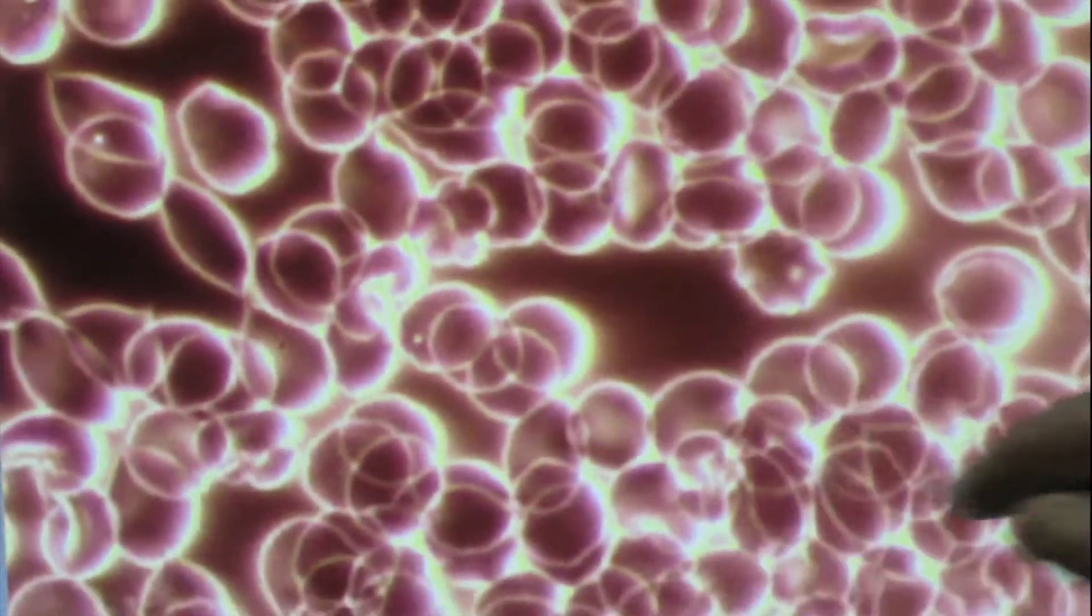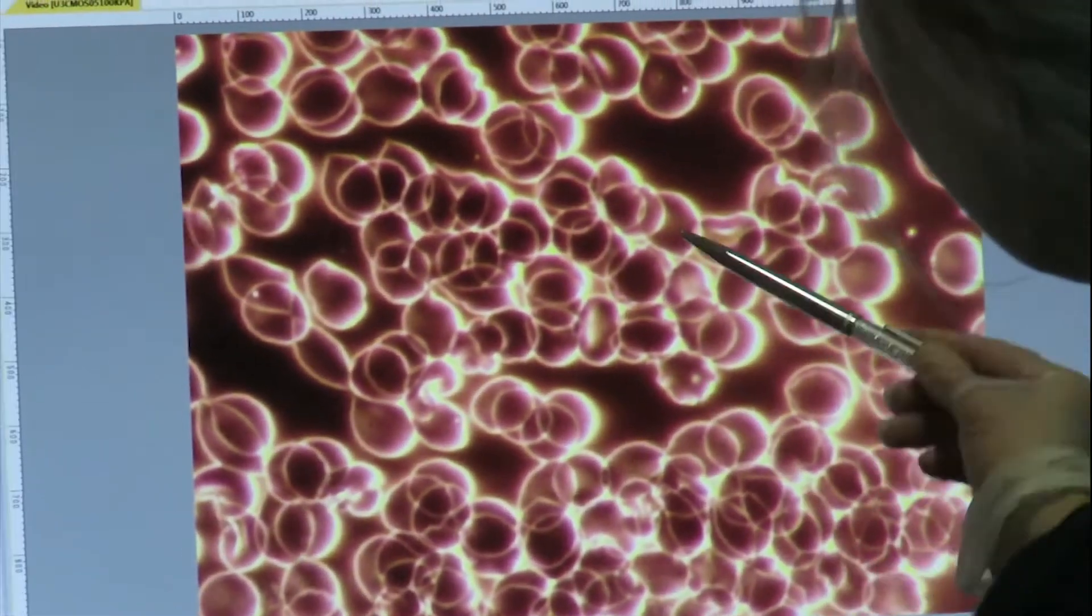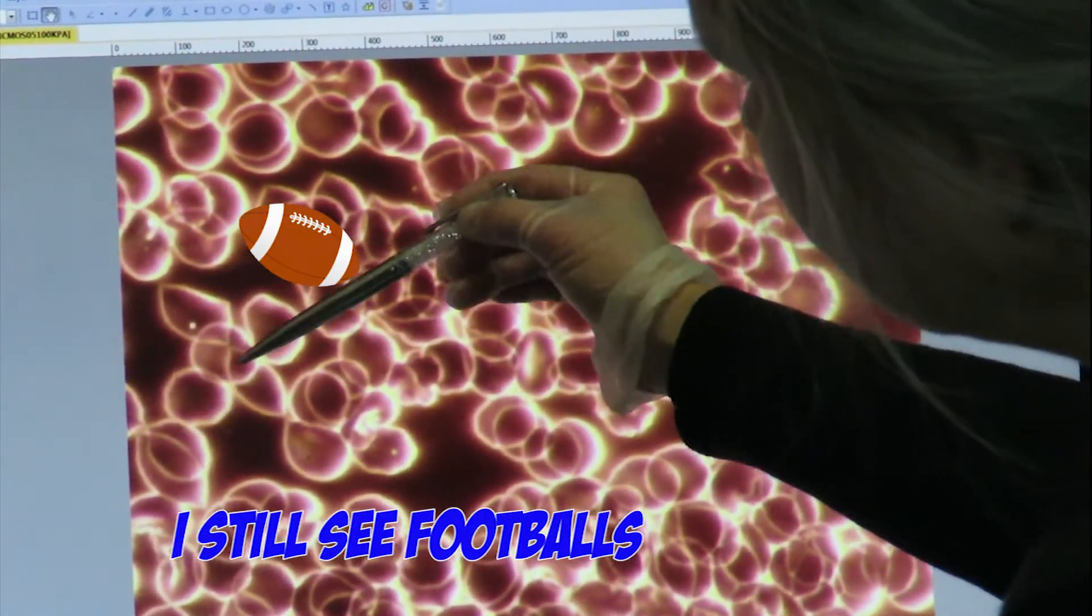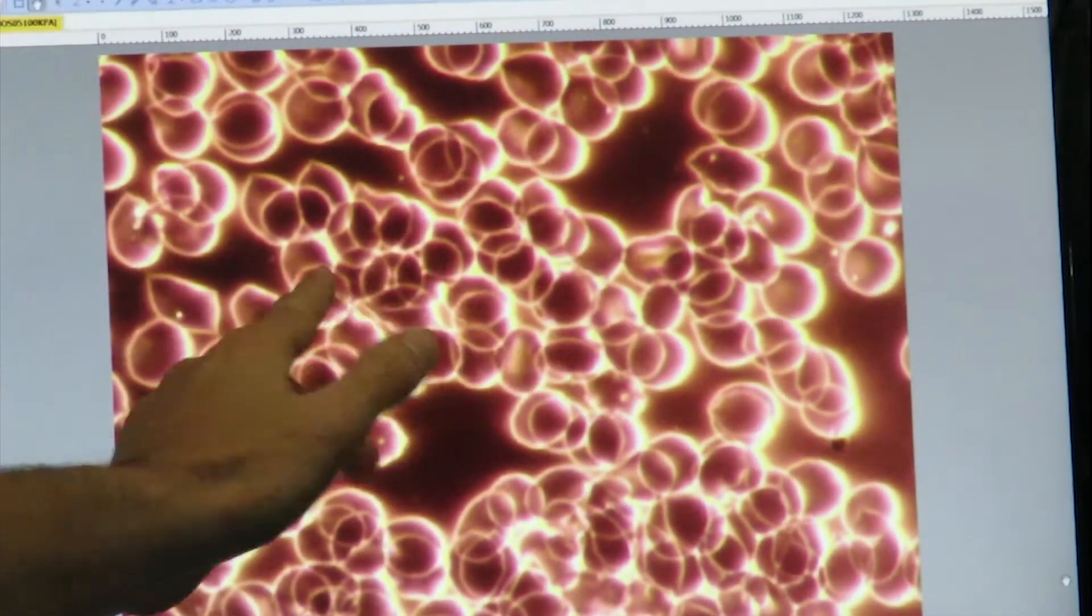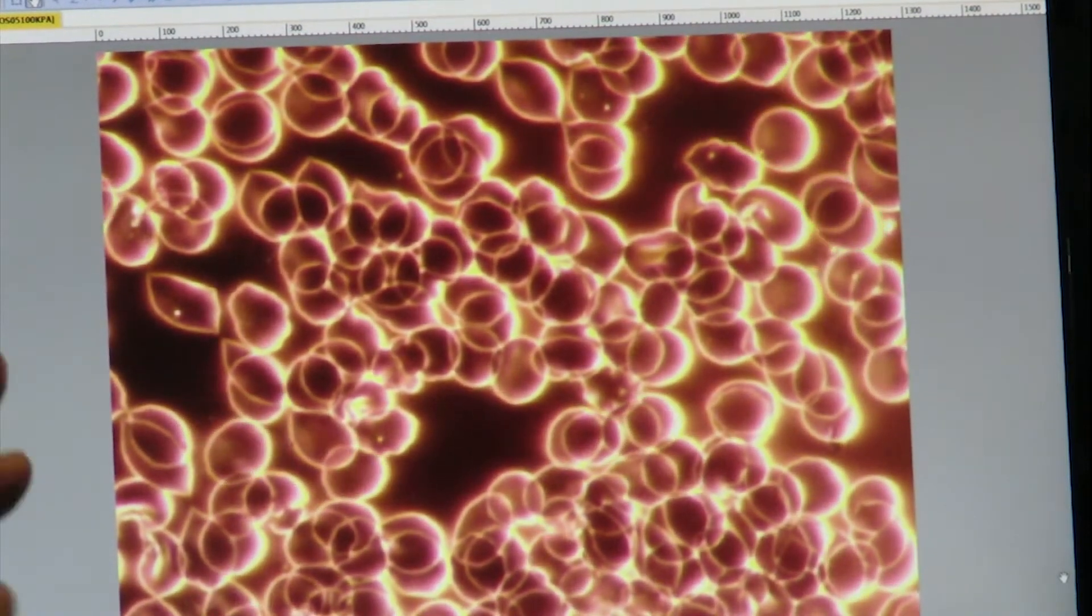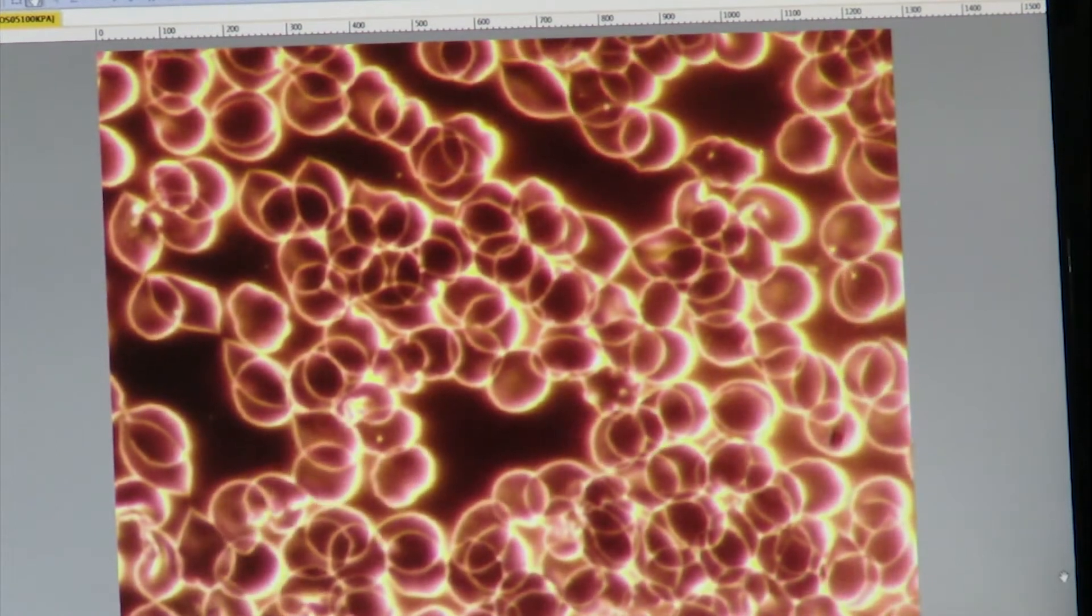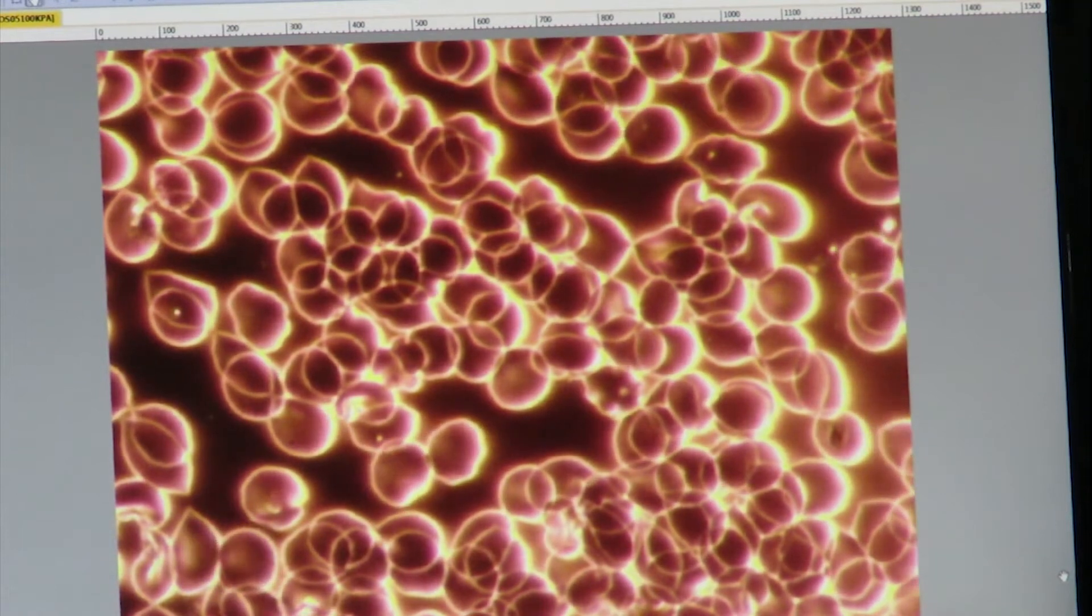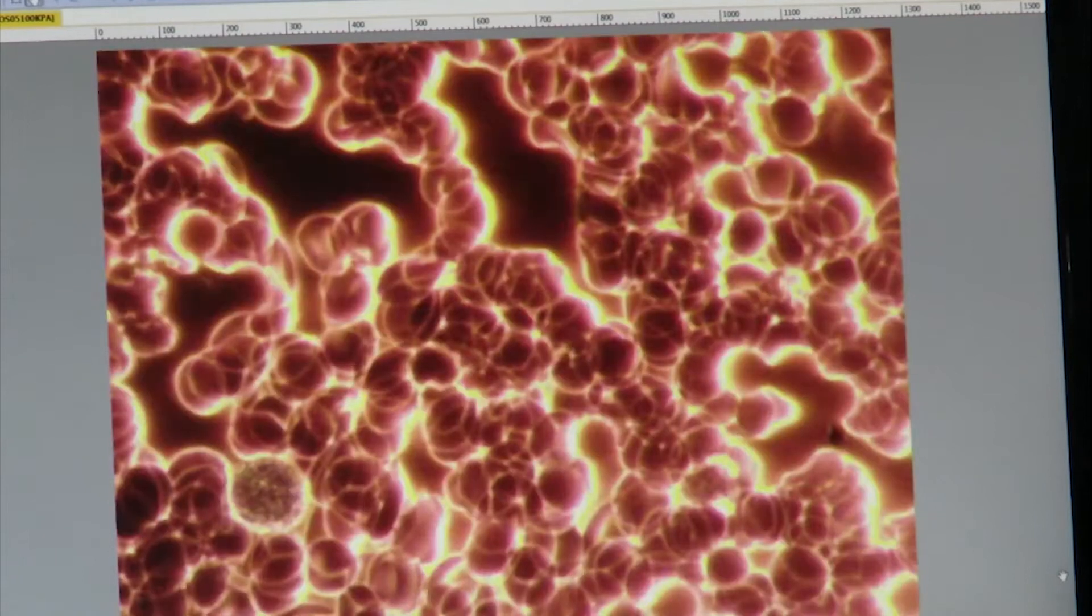This is a nicer area, much cleaner. We have a little bit of an Ascarius egg there. Most of the cells here are nice and clean. Again, here is that lemon-shaped cell. What's that one moving? These ones here now, they're moving. Why is that? This is perfectly fine. Your red blood cells should be moving. I'm seeing a patch of no movement at all, and then all of a sudden they start moving. That can happen if the plasma is a little on the slow side. If it's sticky, some cells will get by and some cells won't. I can see some breaking down here and there.